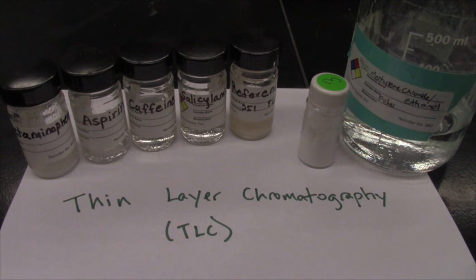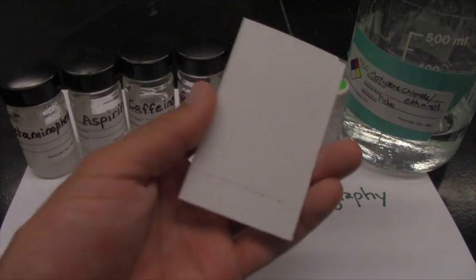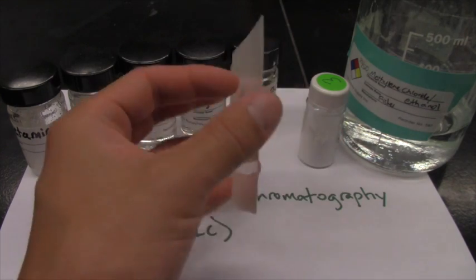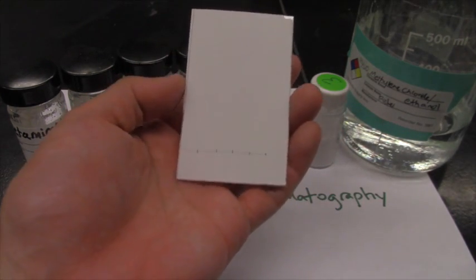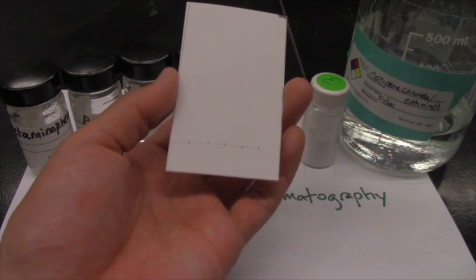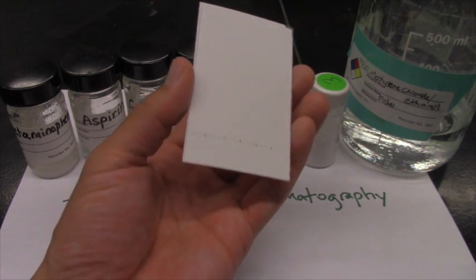Today we're going to be doing thin layer chromatography, also known as TLC. And the first thing that we need to talk about is what an actual TLC plate looks like. So this is a TLC plate. It's got a shiny side and it's also got a matte side. We're going to be using the matte side to spot our different compounds down onto the plate.